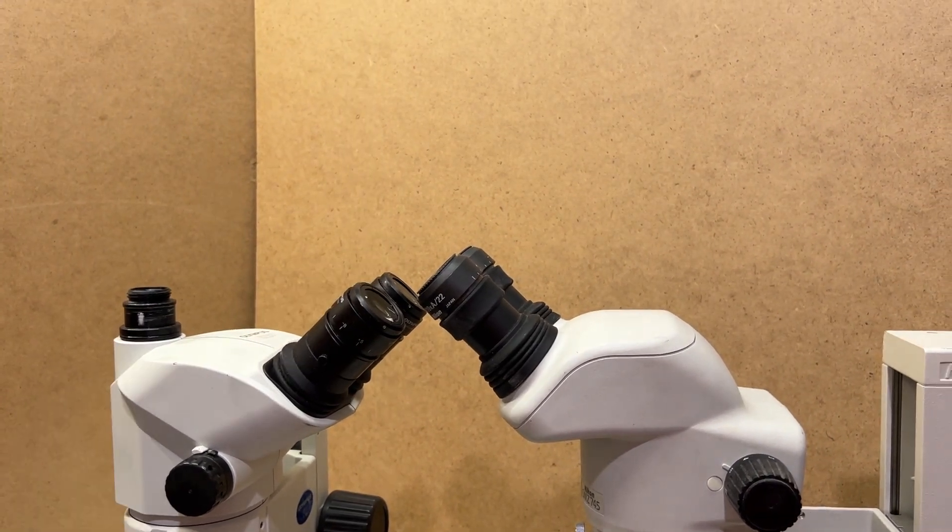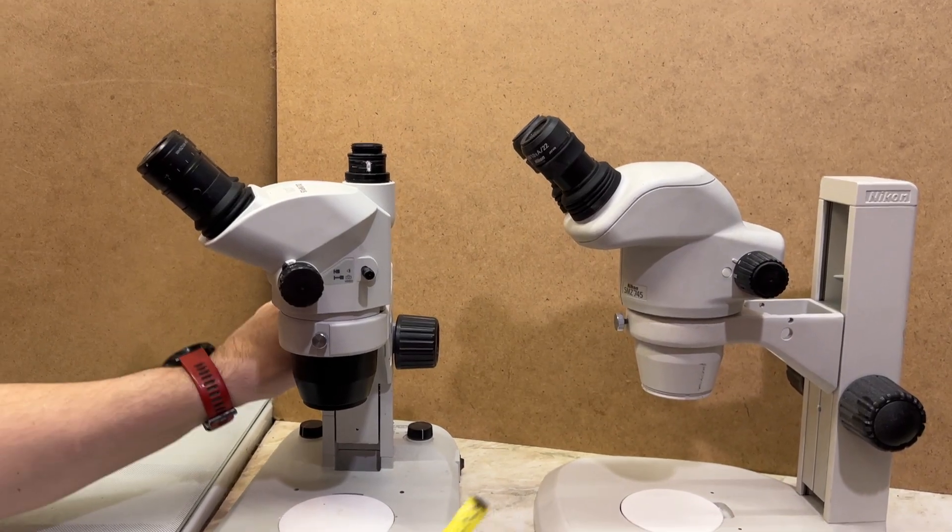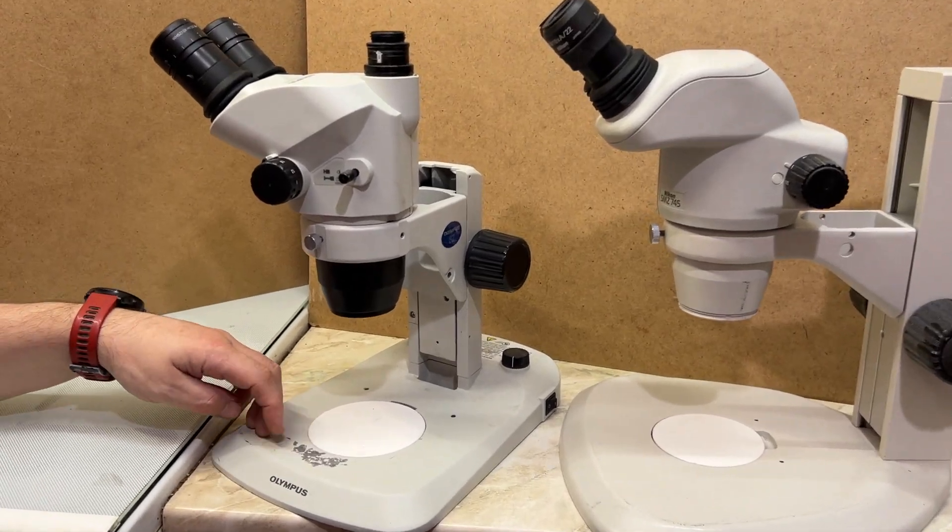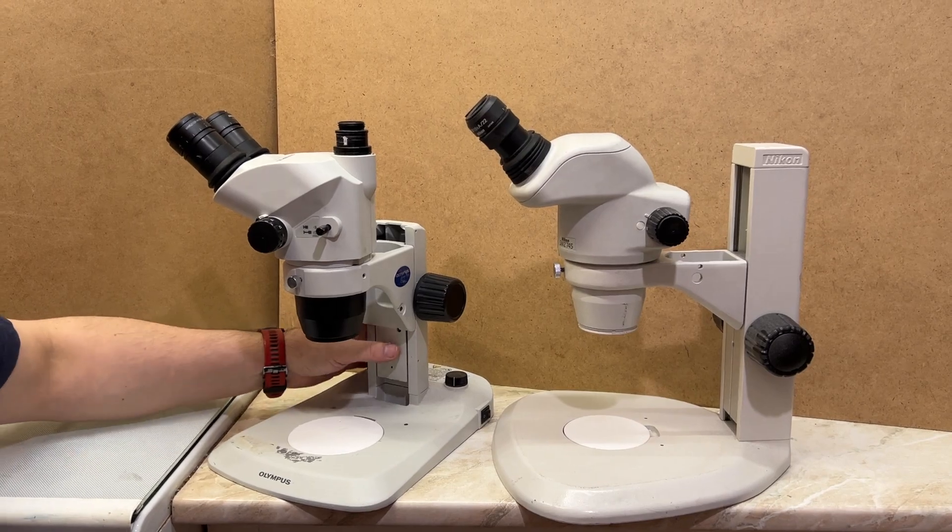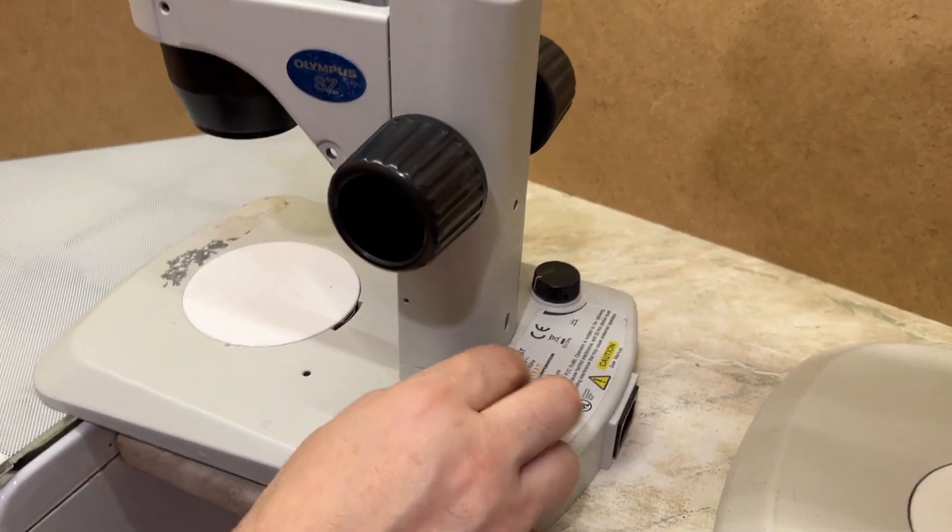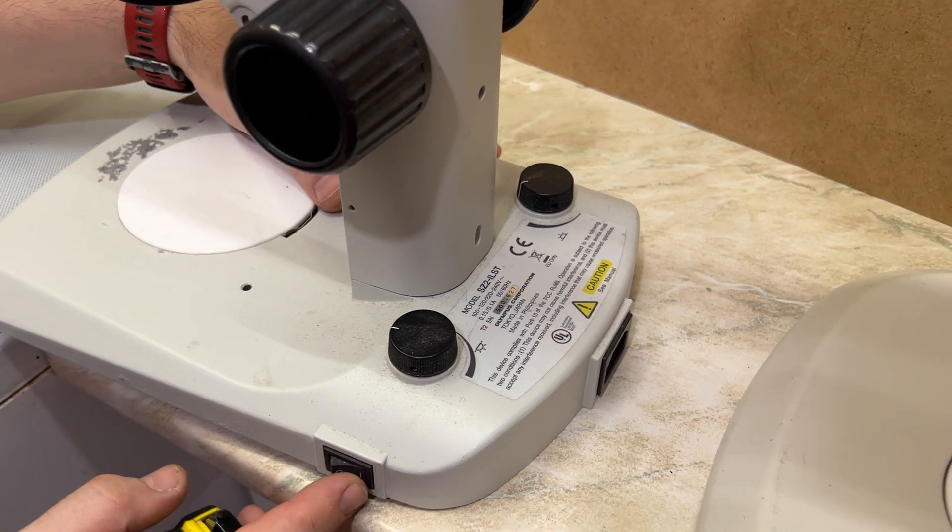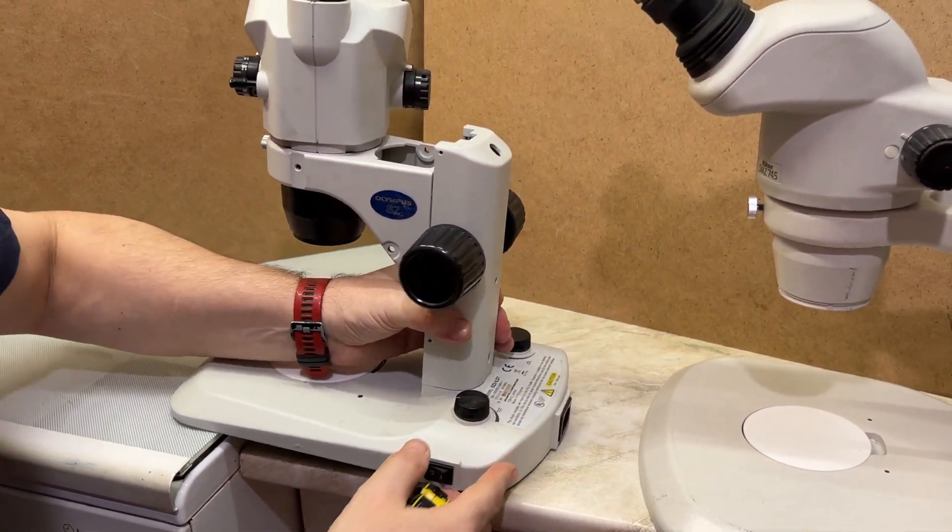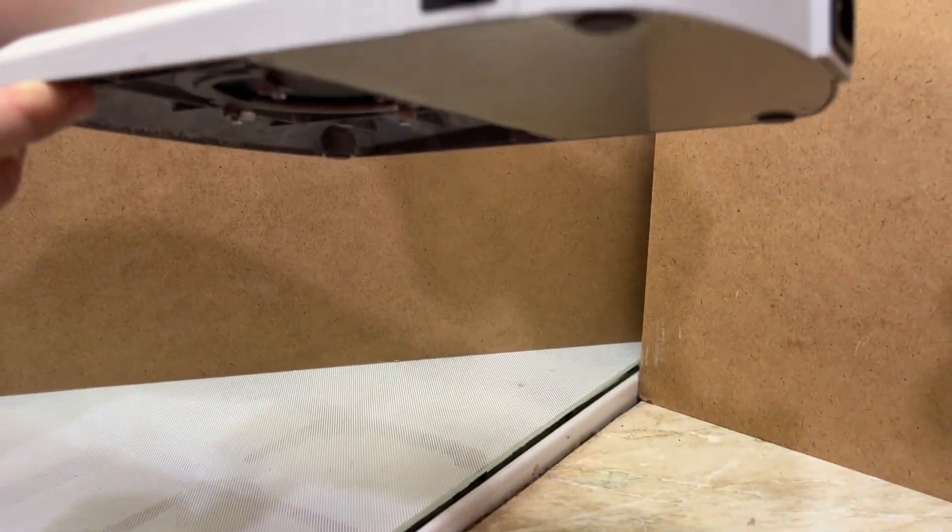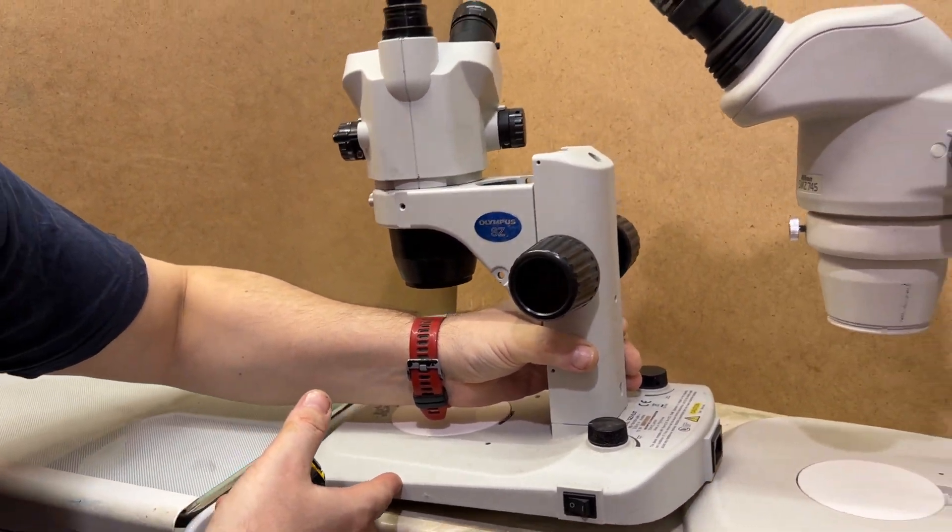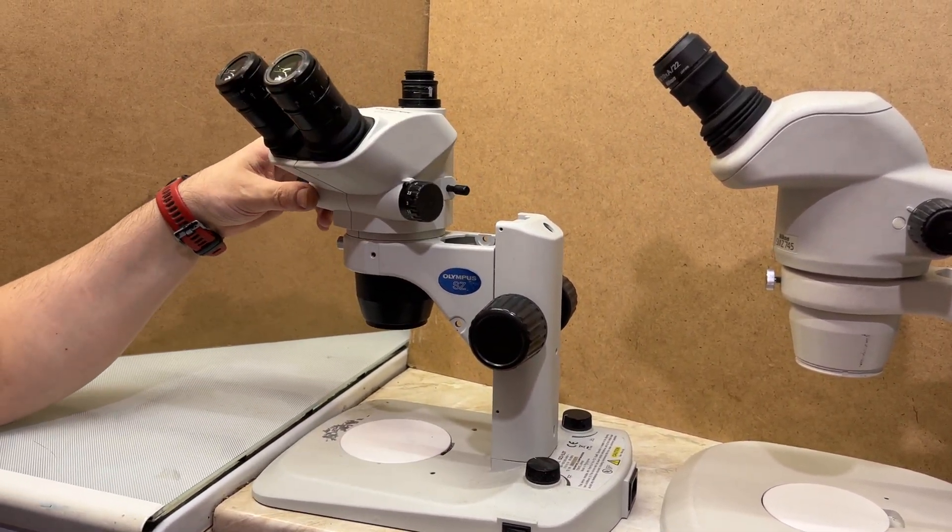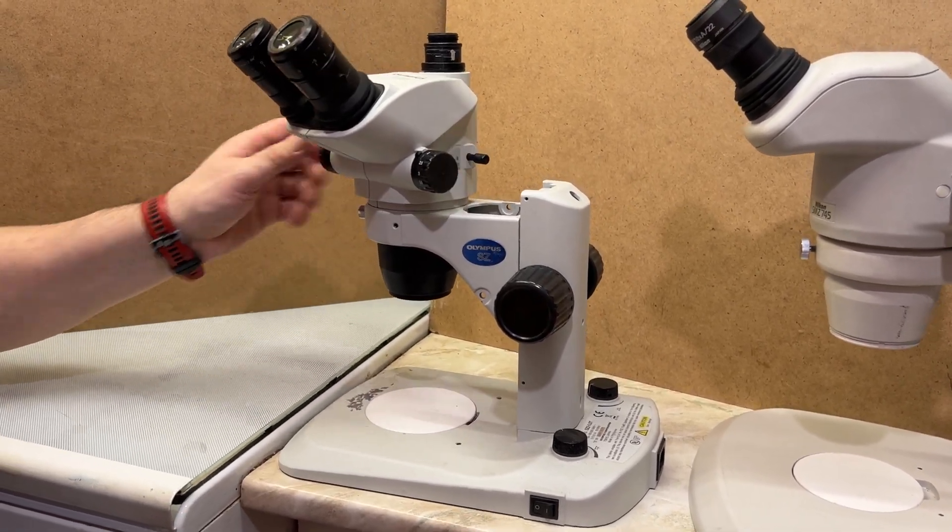We have the Olympus stand here. It's not that nicely painted, there's some kind of rust. It has two light regulators, but I don't know what they regulate because I don't see any connections here. We have a power unit inside with a standard plug, but I don't see where these devices are connected. We might just have dummy potentiometer regulators.